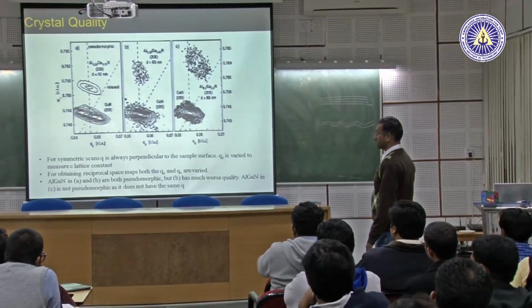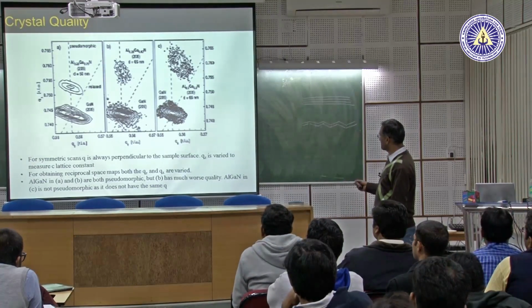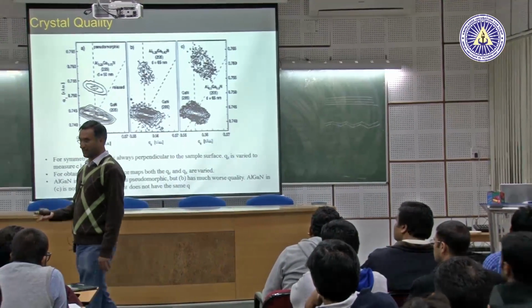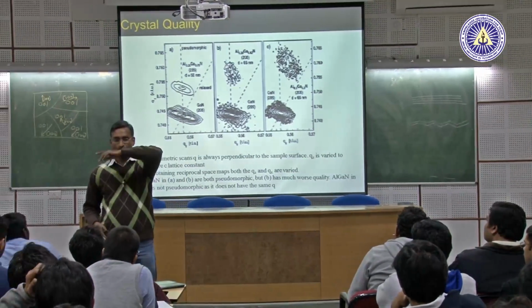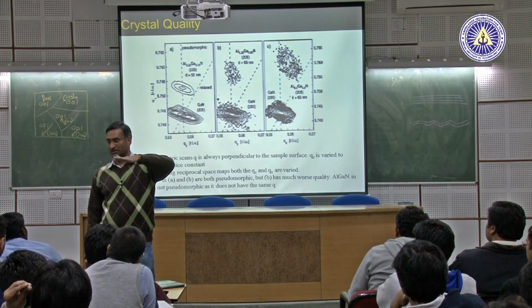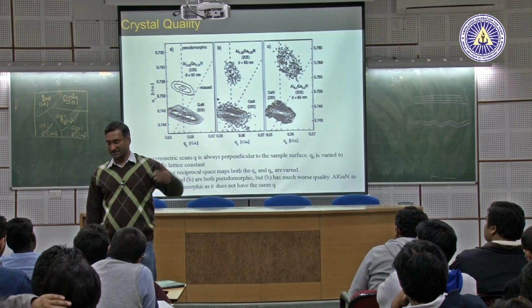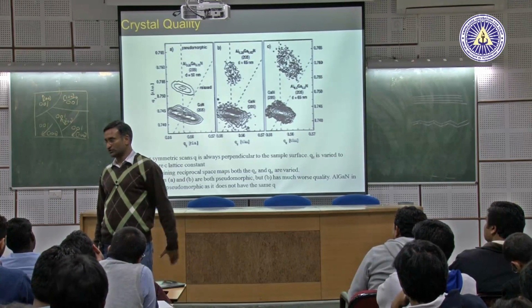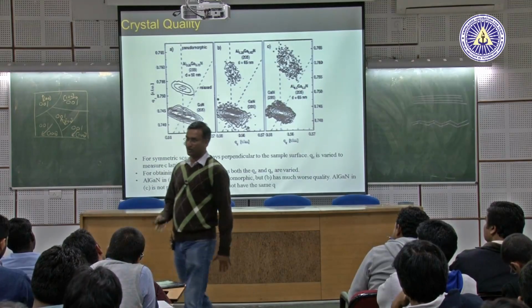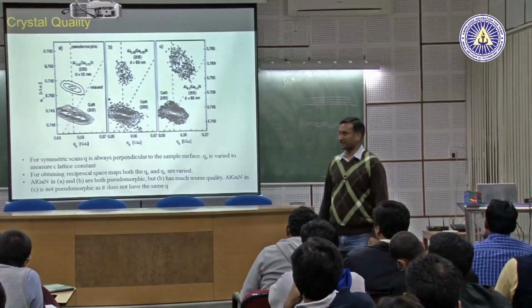Substrate is gallium nitride, yeah. Because remember, X-ray also doesn't penetrate deep into the sample. In these scans, you choose your measurement conditions so that your penetration depth is not very large, especially if you are looking at asymmetric peaks. Then the beam is coming almost parallel to the substrate, so you are looking at the planes which are parallel to the interface. So at the interface you have effects on the substrate as well, and there could be interfacial reactions and things like that.